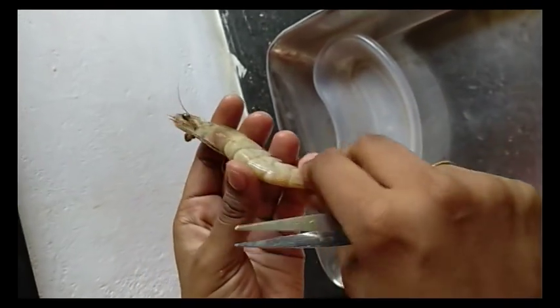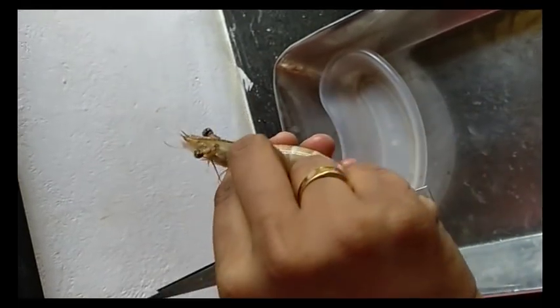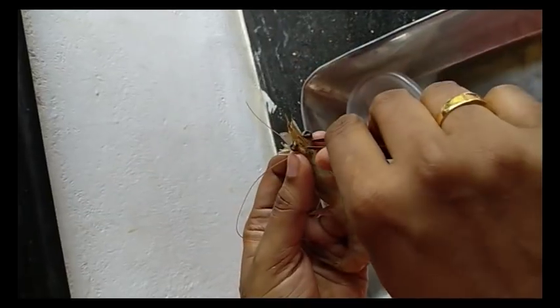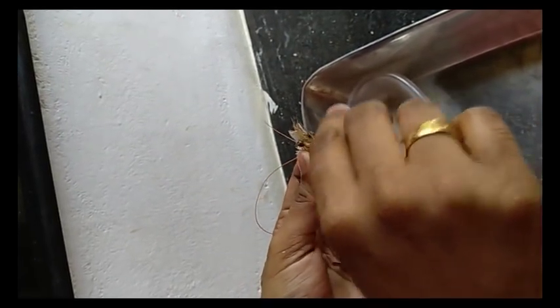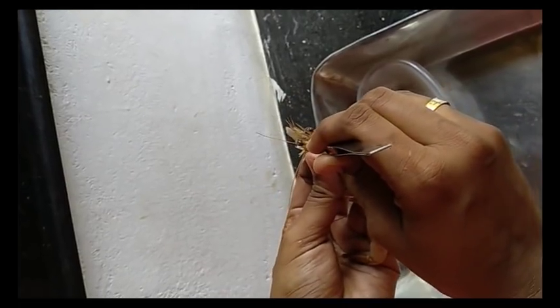Today we are dissecting a prawn to expose the nervous system. This is the carapace. This is the rostrum. And the prawn brain is seen at the base of the rostrum.